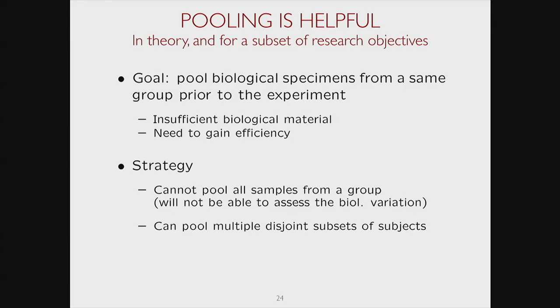So is it a good idea or not? One thing which is a really, really bad idea is to do this. Take all the healthy subjects, mix them together, take all the disease subjects, mix them together, and then we'll have one healthy run and one disease run. Because this is exactly the situation which introduces the bias, because now we don't know if the difference between the two samples is because it's healthy and disease, or is it because this was acquired first and this was acquired second. Plus, we don't even know what is the variability associated with each group, because we only have one number. So we lost all the replication, right? And we introduced the bias. So one thing to never do is to mix all the healthy together and all the disease together.